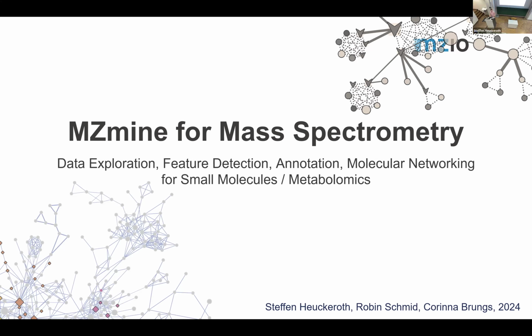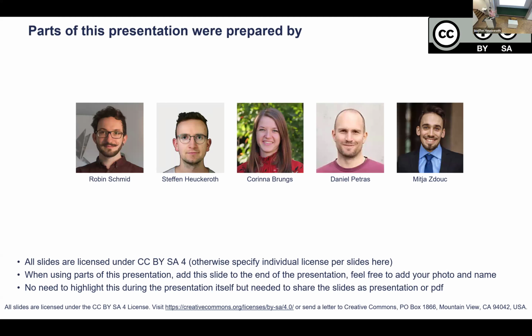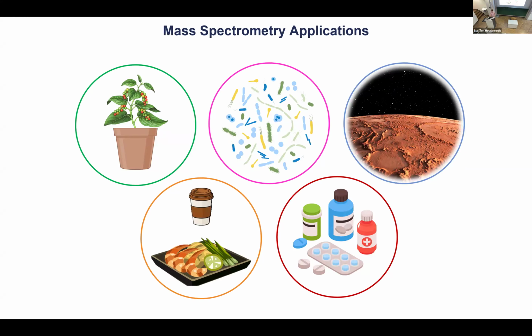to MZmine for mass spectrometry and data processing. And of course, I didn't do this whole presentation on my own. Some of the slides were lifted from some other people. That's why you will also see some of the same slides I used yesterday.